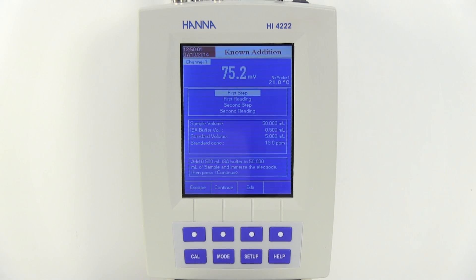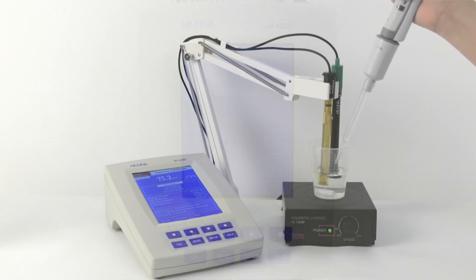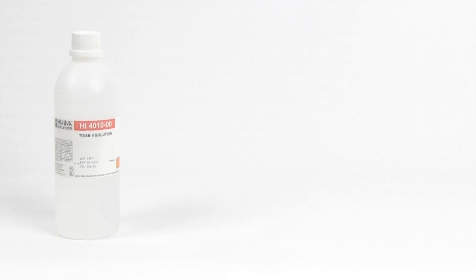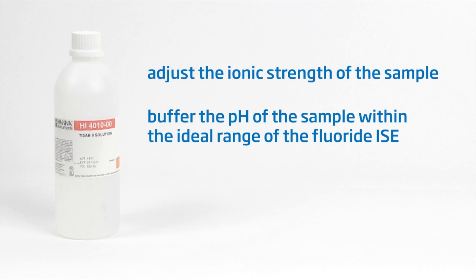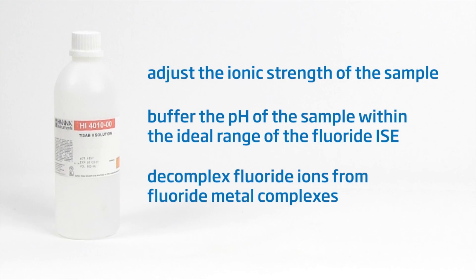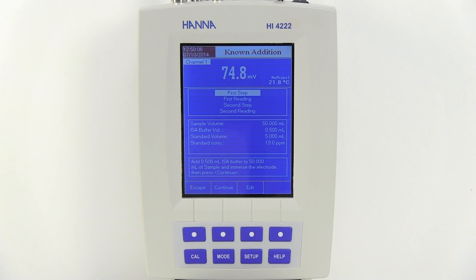Add 0.5 mils of HI4010-00 TISAB II solution. The addition of TISAB to the samples serves three purposes: to adjust the ionic strength of the sample, to buffer the pH of the sample within the ideal range of the fluoride ISE, and to decomplex fluoride ions from fluoride metal complexes, ensuring they are free in solution and able to be measured. Once added, press Continue.